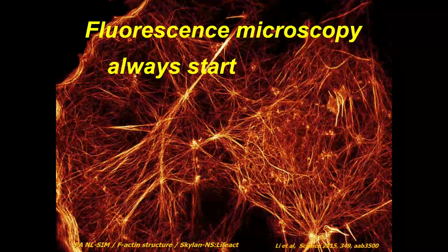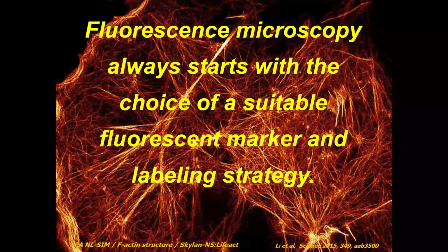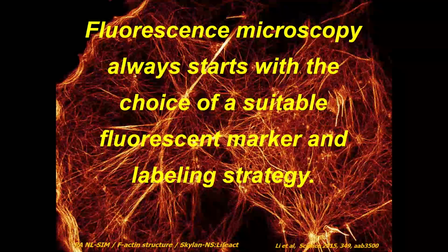I'll start with this nice super resolution image, and with a statement that I think you would all agree with. Whichever nice fluorescence imaging technique you want to use, you need to start with the choice of the right fluorophore and the right labeling strategy. So that's why I'm here to tell you things about them.